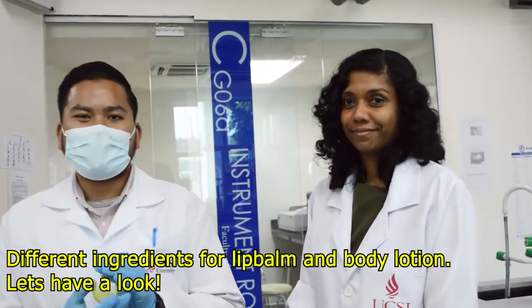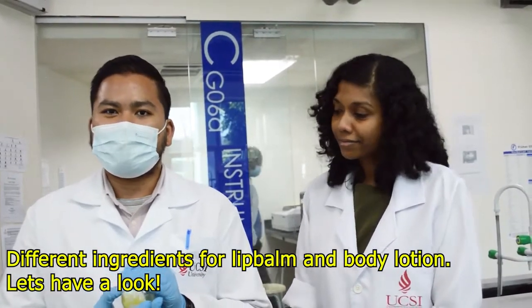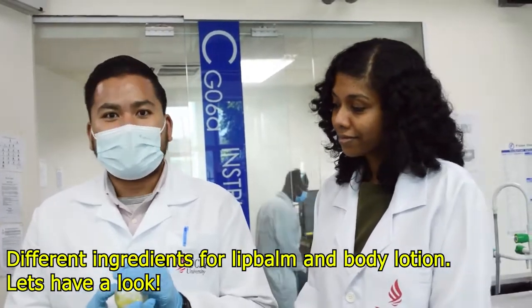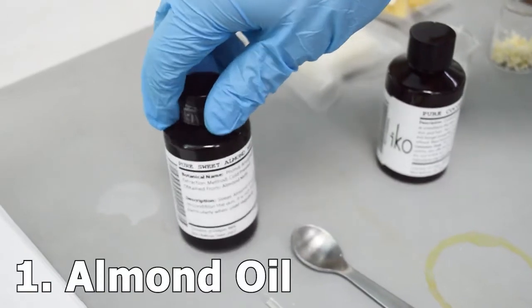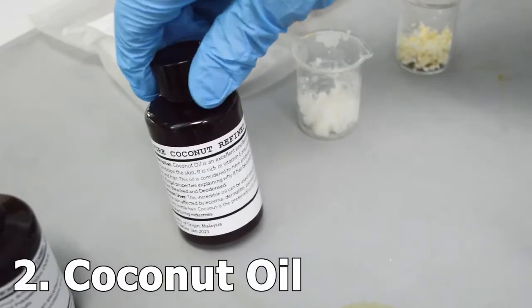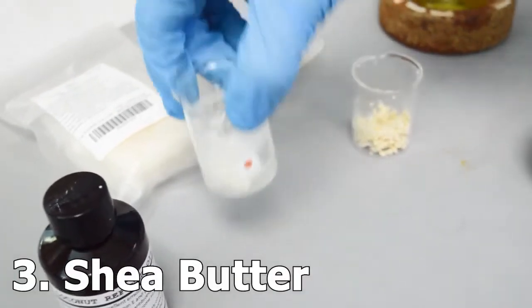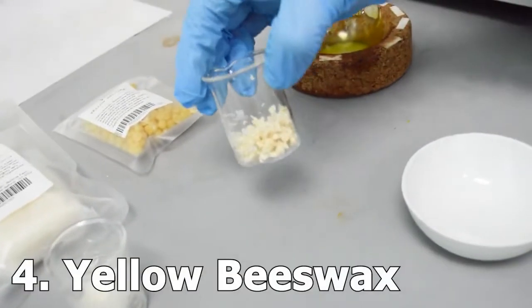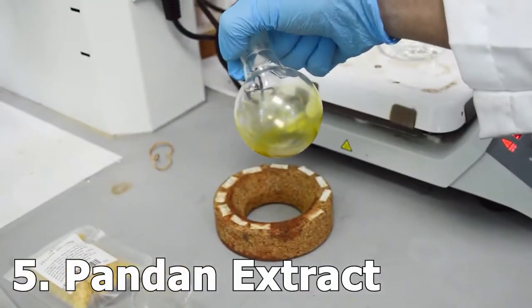For the body lotion and lip balm, we have several ingredients needed. Let's check out all the ingredients. The first ingredient needed for the lip balm is almond oil. The second ingredient is coconut oil. The third ingredient is shea butter. Then we have the yellow beeswax. And lastly, the pandan extraction that we extracted earlier.